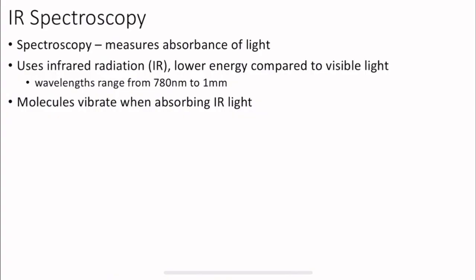Now, which part of the molecule interacts with infrared radiation? Well, IR actually causes molecules to vibrate, or in other words, causes bonds to bend and stretch, causing tiny displacements within atoms of a molecule. Of course, IR energy is not strong enough to break these bonds.